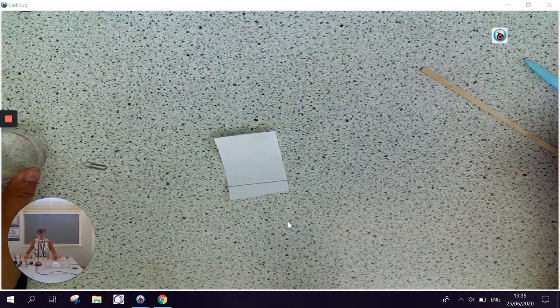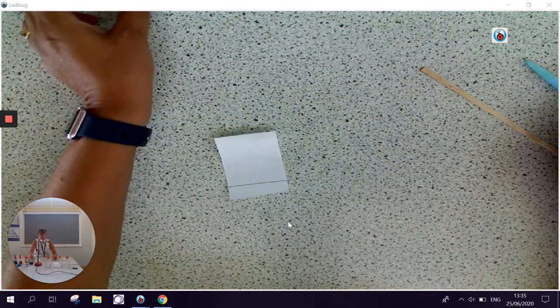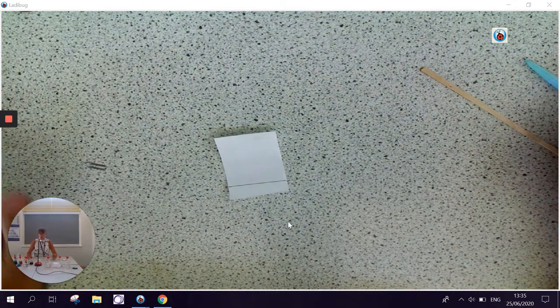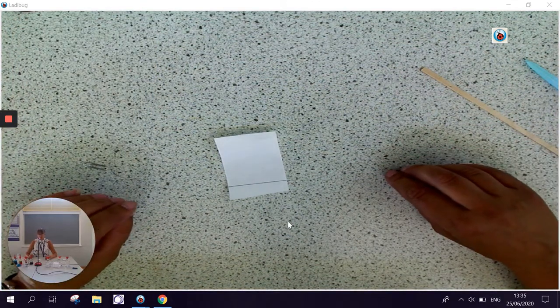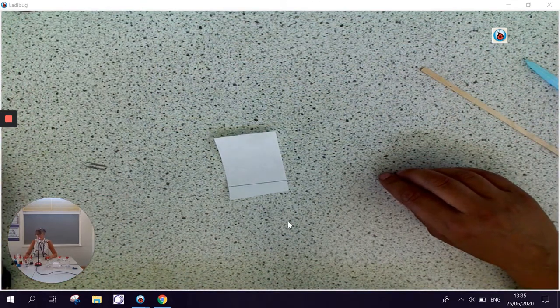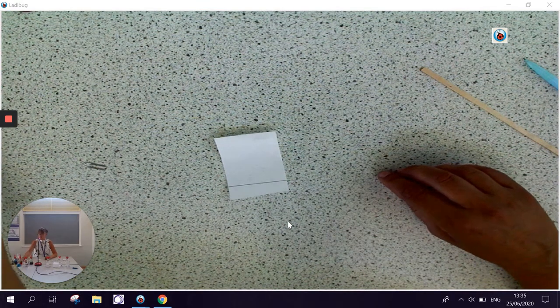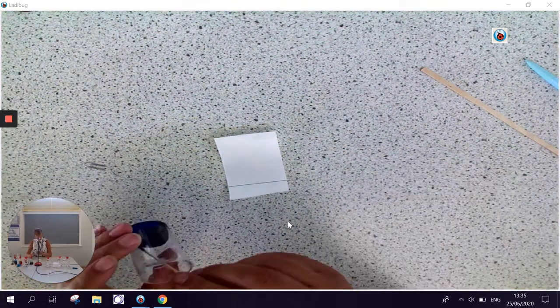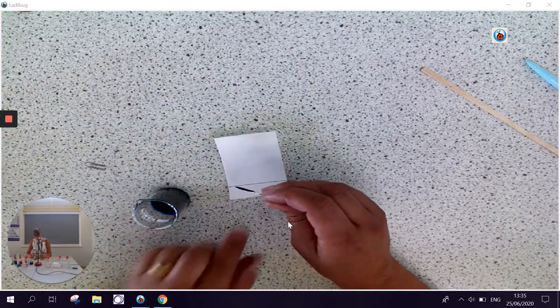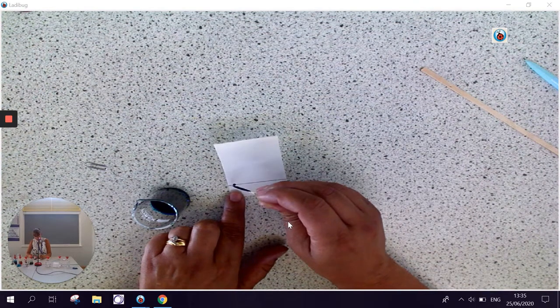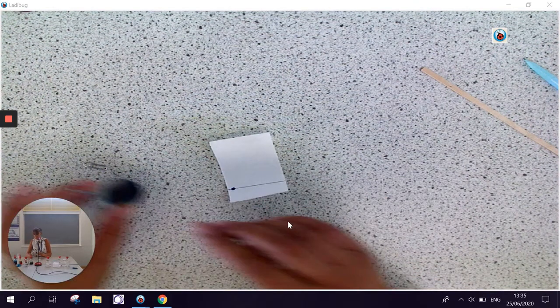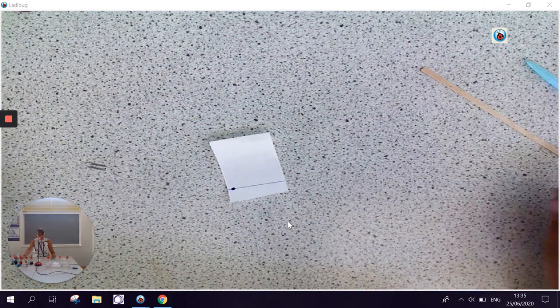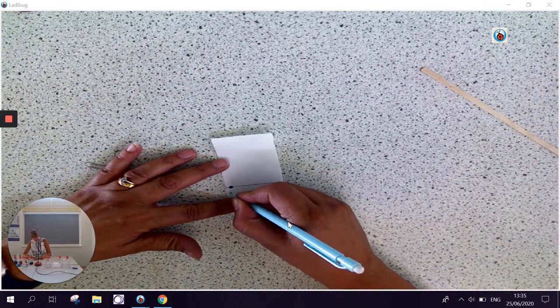Often in exams, they will give you some known colours and you have to compare them to some unknown colours. So for this practical, I've got some blue ink. I'm going to put a dot of blue ink on the pencil line, and I can label that as blue underneath.